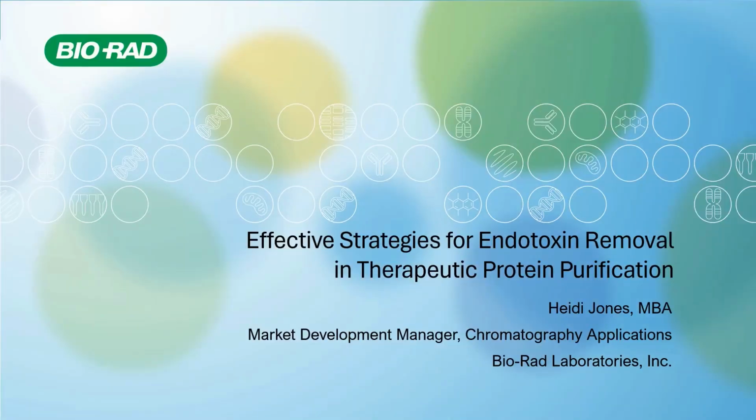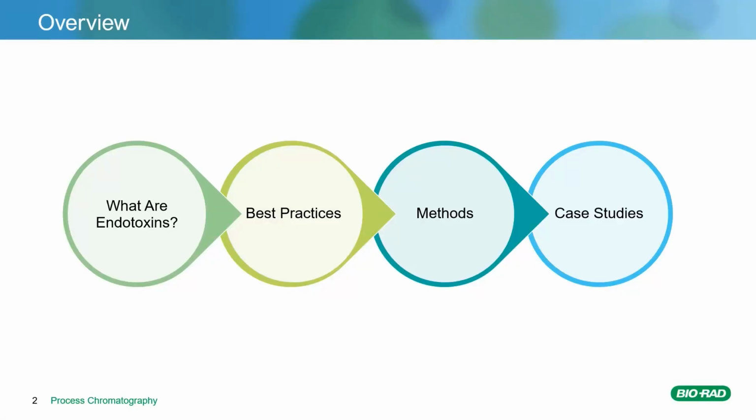Thank you very much for that introduction, and thank you to the listeners for joining us today. Today we're going to be talking about effective strategies for endotoxin removal in therapeutic protein purification processes. First, I'll be discussing endotoxins and why they are so problematic in biotherapeutics. Next, I'll be discussing best practices to avoid endotoxin contamination, along with methods of endotoxin removal, and we'll end with some case studies describing the successful depletion of endotoxins using 2 of Bio-Rad's resins.